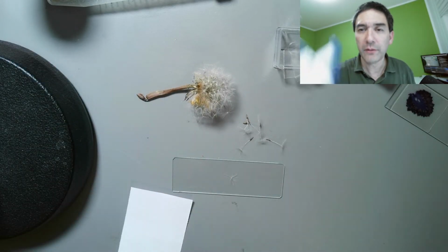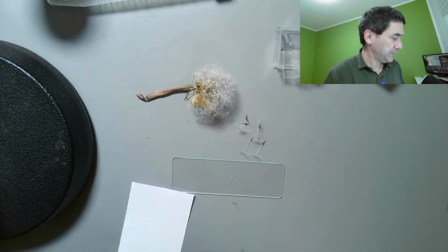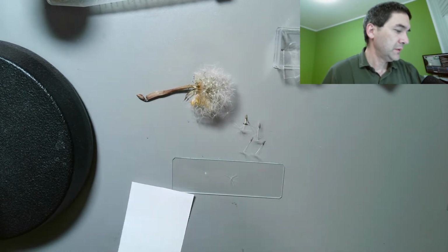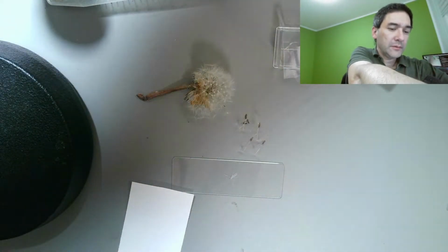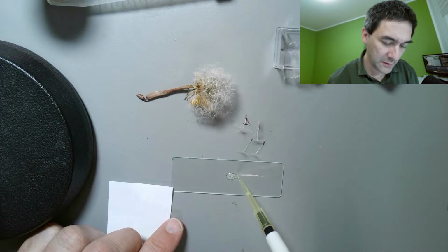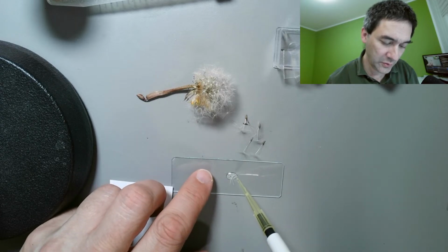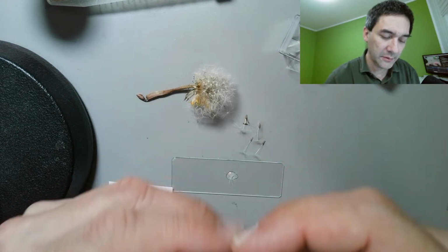I just dropped my pipette, and a little bit of water again. I'm going to put some water on here. Cover glass goes on top.